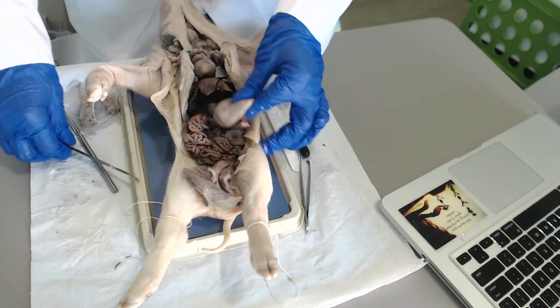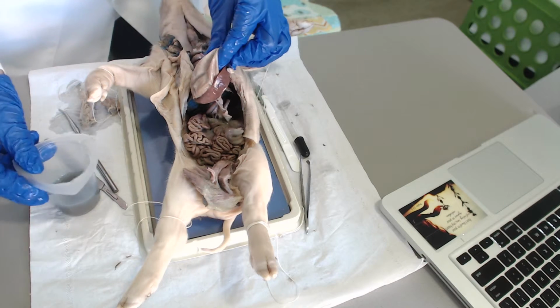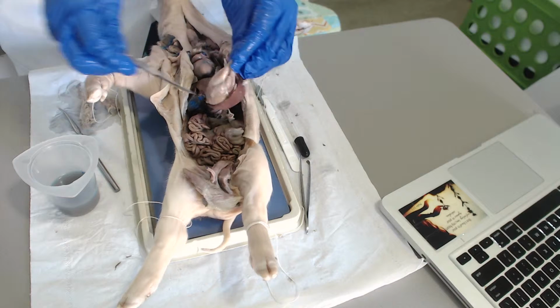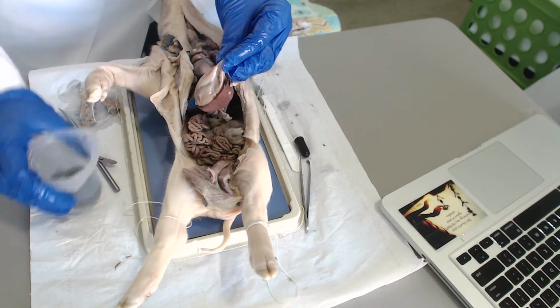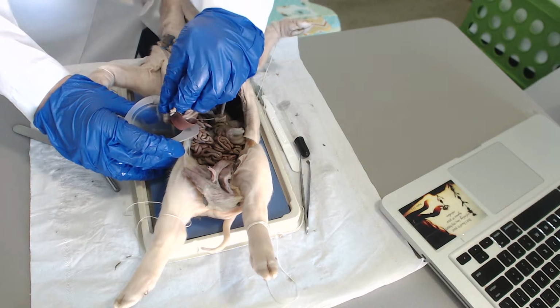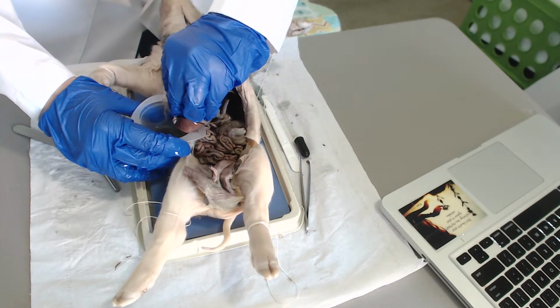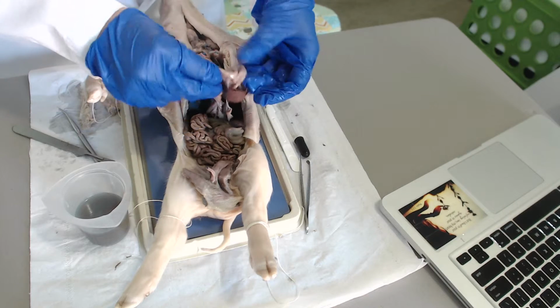Okay. So here we have the stomach, and we're going to open up the inside of it. I'm going to pour out the contents of the stomach first. Alright. So again, we have the stomach.